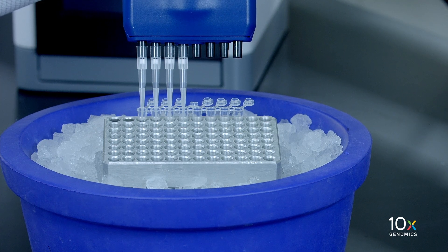If multiple chips are run back-to-back, cover or cap the gem-containing tube strip and place on ice for no more than one hour.